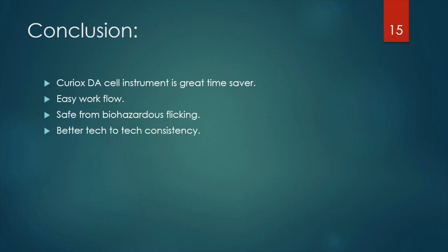Wonderful. Thank you, Dr. Putheti. That was a very informative presentation, and we do have some questions that have come in. First one: how easy was it to use the plate and washer? The plate does not have any walls separating the wells from each other. Did you see any cross-contamination?